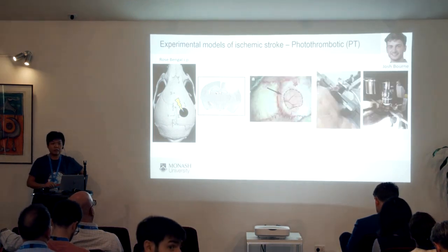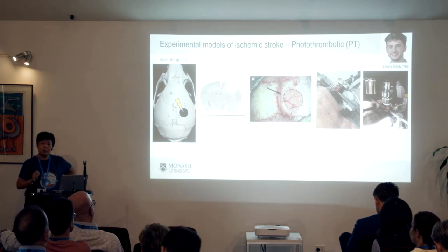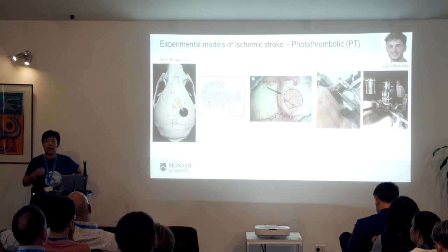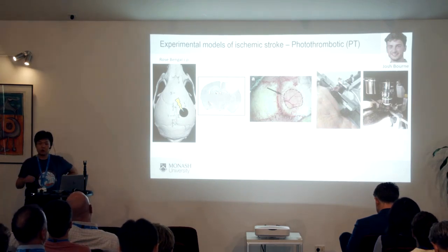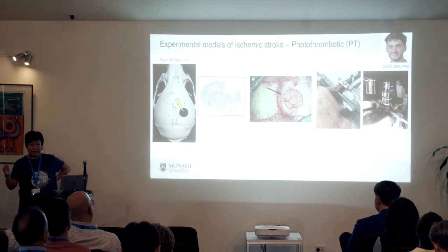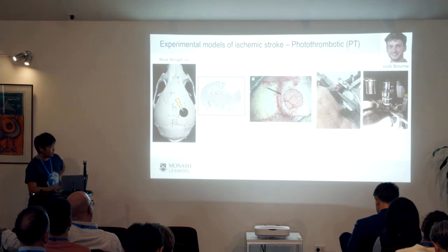In my lab, we specialize in a technique called intravital microscopy. What that means is that we can study blood vessel activity live in an animal. We do that in the brain by shaving the skull to a membrane-thin layer, so a laser can shine through, and we can watch processes in real time.